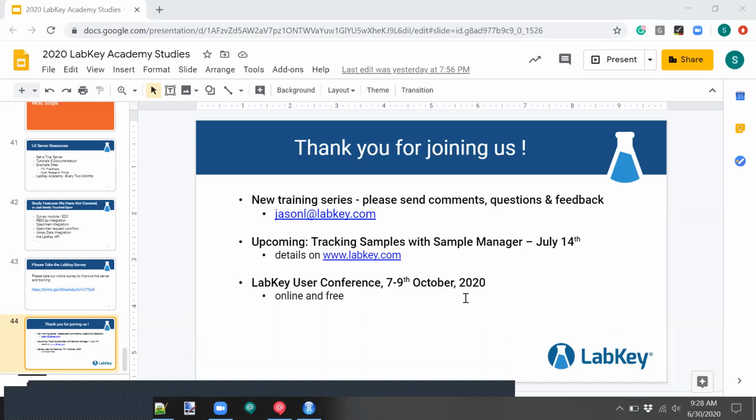I also think, Steve, it's worth mentioning that 99% of what you showed today is in the Community Edition. Oh, I'm really glad you mentioned that, Jason. Yes. The only feature that I showed that was a premium edition feature was that file watcher feature. So this was basically a demonstration of Community Edition features, which are free. It's amazing how much you can do with the Community Edition, just to stress that.